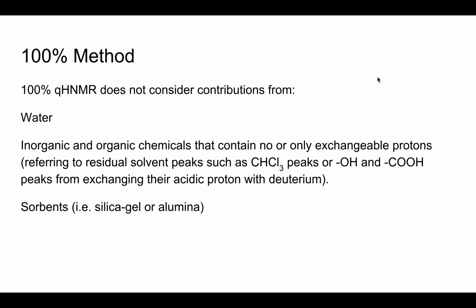One is residual solvent peaks, such as chloroform. Whenever you dissolve your sample into CDCl3, or deuterated chloroform, there is a small percentage of CHCl3 that's present in the bottle that you use to dissolve your final sample.